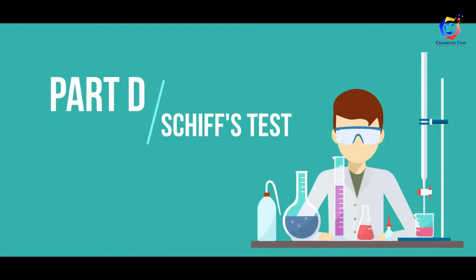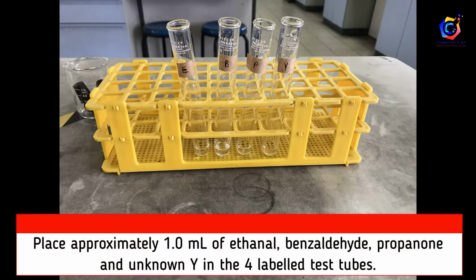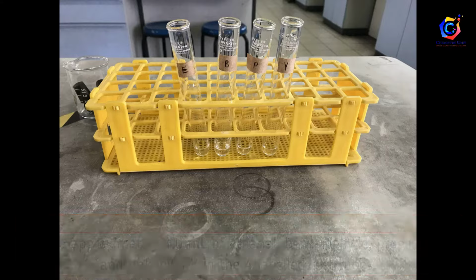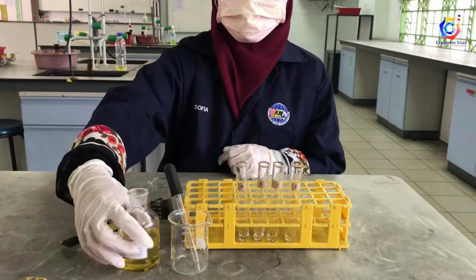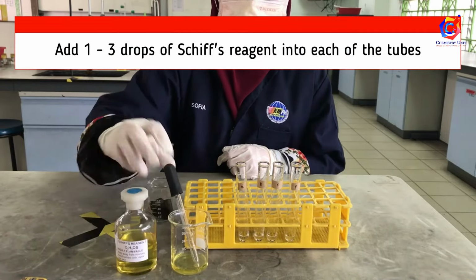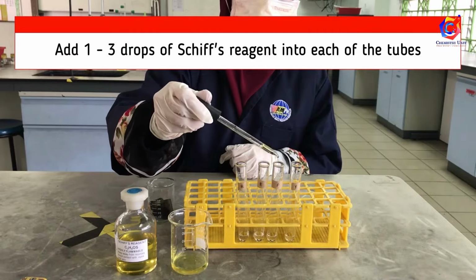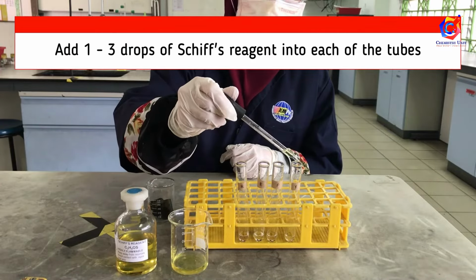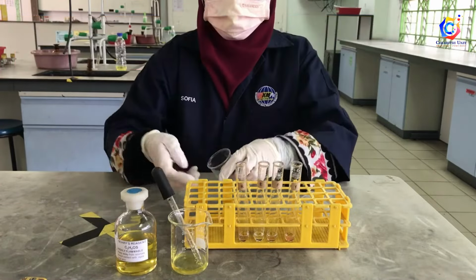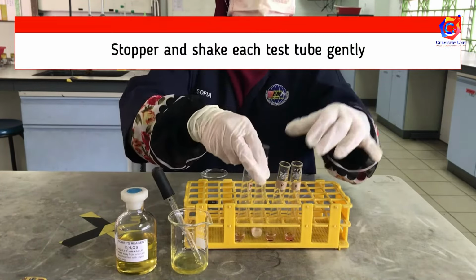Part D. Schiff's test. Place approximately 1 ml of ethanol, benzaldehyde, propanone, and unknown Y into 4 separate test tubes. Add 1 to 3 drops of Schiff reagent into each of the tubes. Stopper and shake each test tube gently.